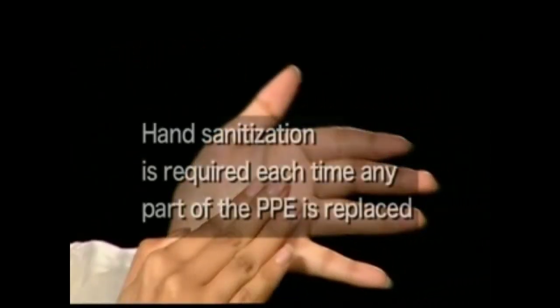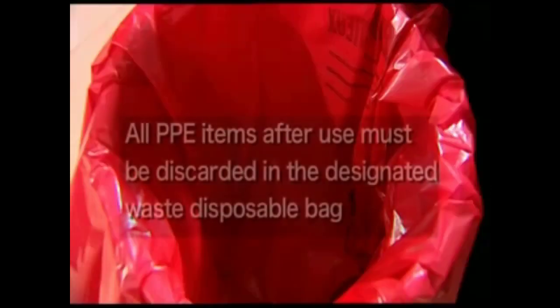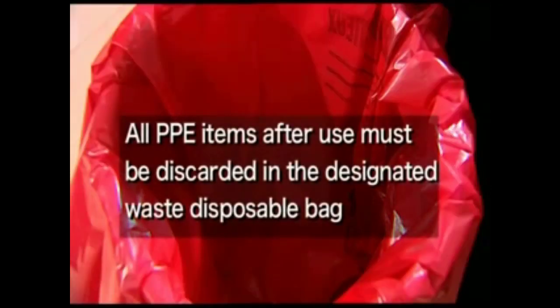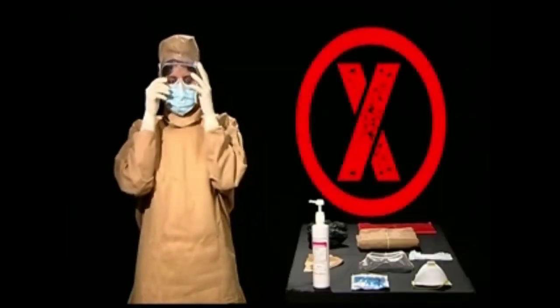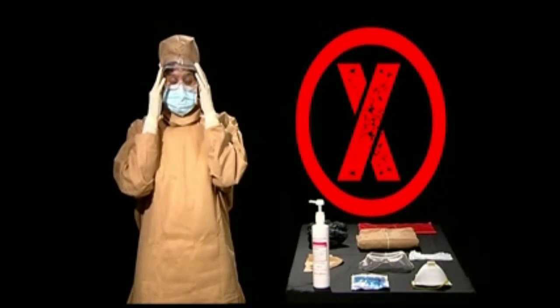The discarded mask should be correctly disposed to avoid being reused. In case some item of the PPE, like goggles or mask, need to be changed, then one should always use a fresh pair after performing hand sanitization.